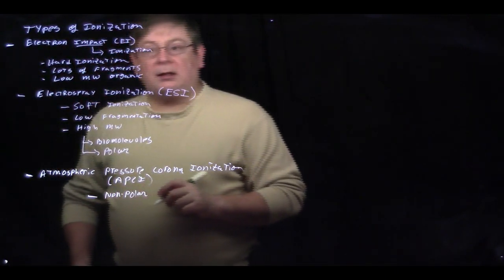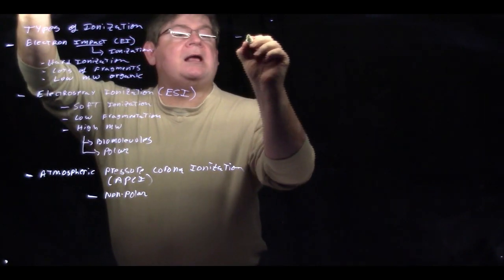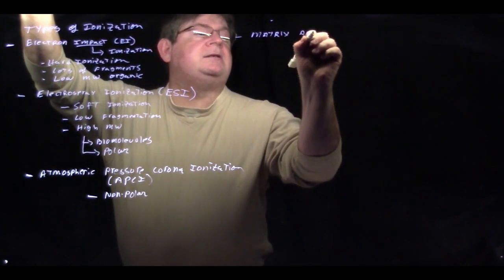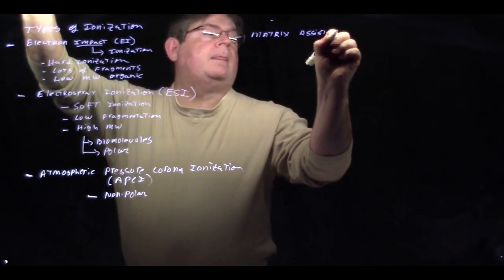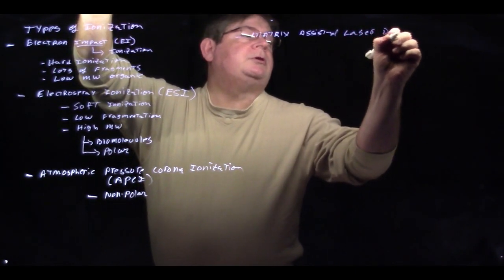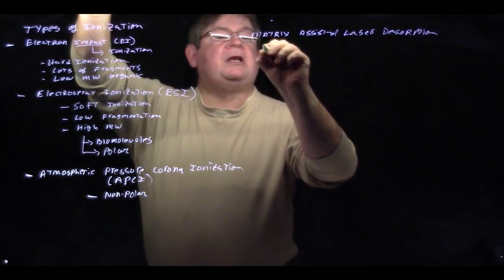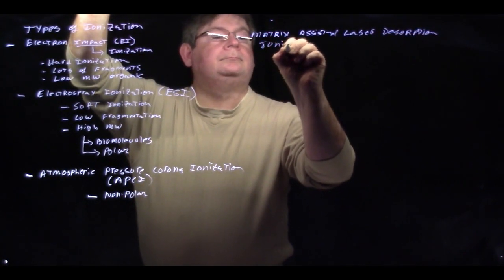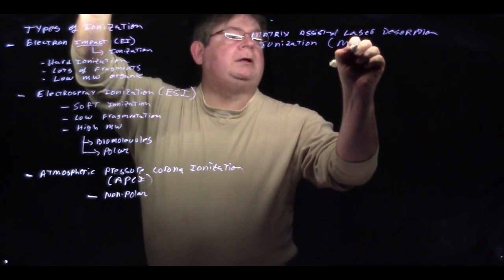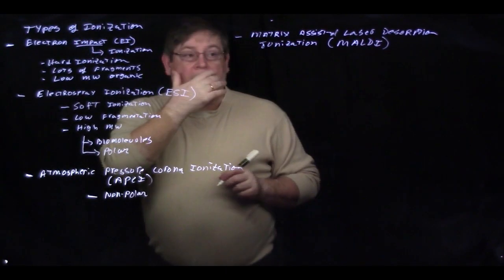And then the last technique that we have available to us is known as matrix assisted laser desorption ionization, or MALDI. Some of you may already have used the MALDI instrument.